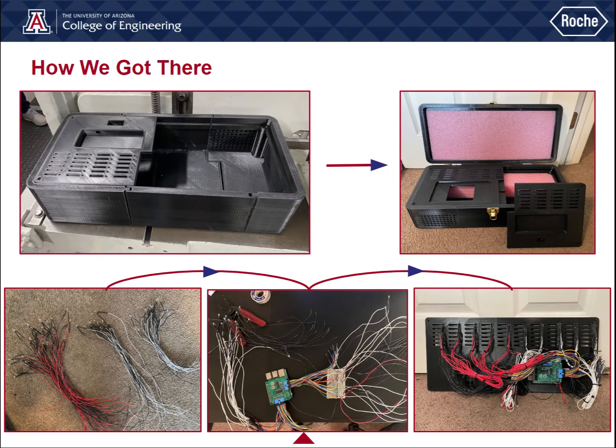Shown here are some photos of the progress we made during the construction of the device. As you can see, we went from a pieced together 3D printed frame to a full frame assembly.